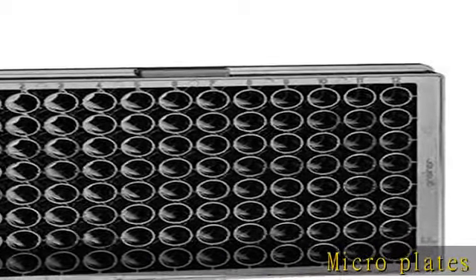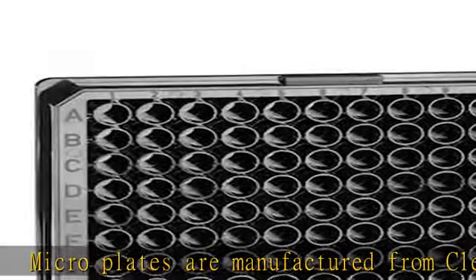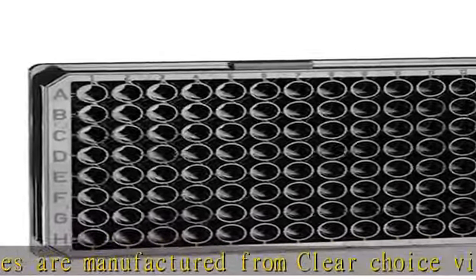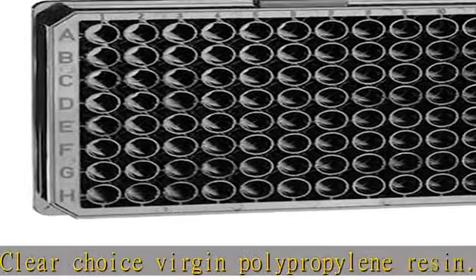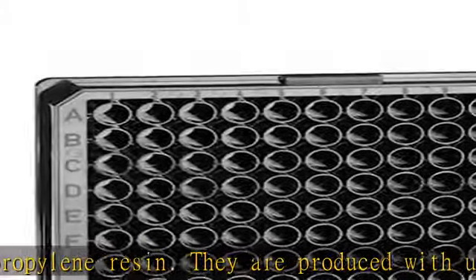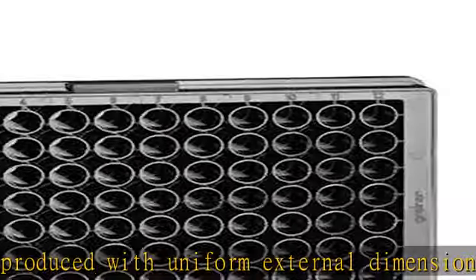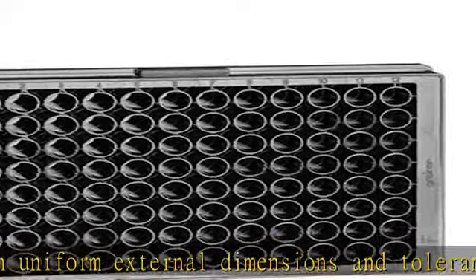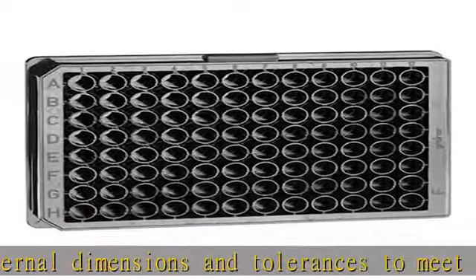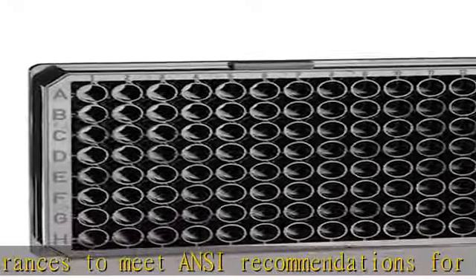Microplates are manufactured from clear choice virgin polypropylene resin. They are produced with uniform external dimensions and tolerances to meet ANSI recommendations for compatibility with equipment and robotics. These plates are biologically inert, exhibit low binding characteristics, offer high temperature tolerance (-196 to 121°C / -321 to 250°F), and are resistant to many standard laboratory chemicals.